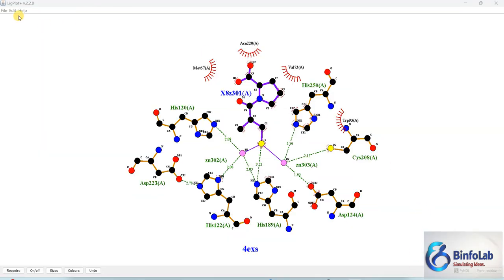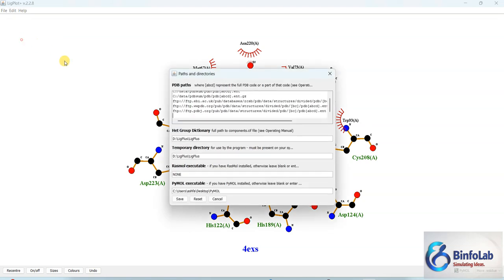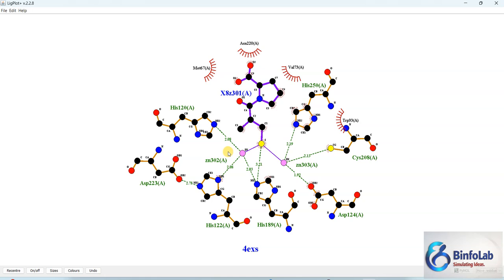Okay, we'll come back. On my computer, the exe path is by default. So what I did, I just removed the .exe, and it should be backward slash. You can see I changed it to backward slash again and removed the pymol exe, and it worked. But in your case, you first try to mention .exe, but if it doesn't work, then you need to remove the exe. That will not be a big problem. Okay. Now, why is it important?